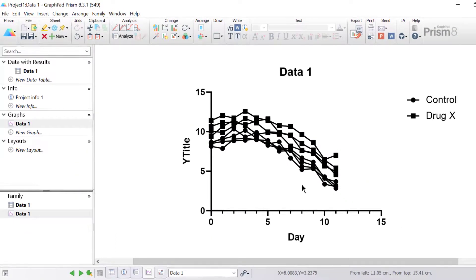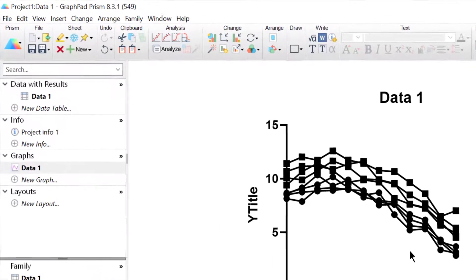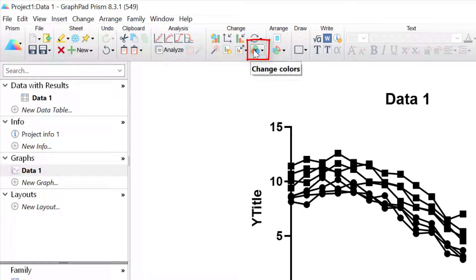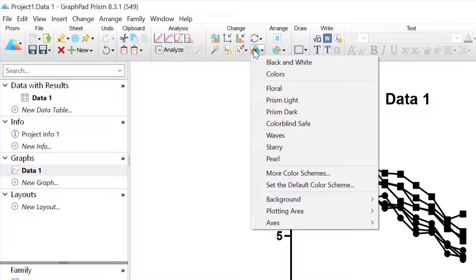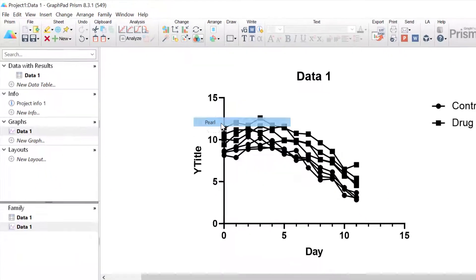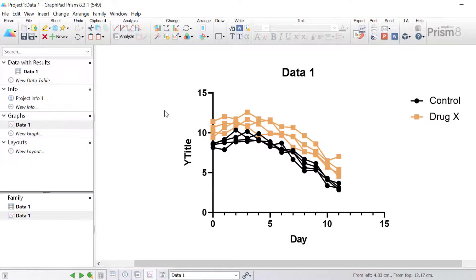To start with, this graph has no colour on it — the lines for each replicate in the two experimental groups are black. To quickly change the colours I will go to the change colours button at the top and select a colour theme. The change colours option is discussed in more detail in a separate quick tip video tutorial. For this video I'm going to select the pearl theme. Notice now that colour has been added to drug X and the lines for drug X are now coloured in yellow.